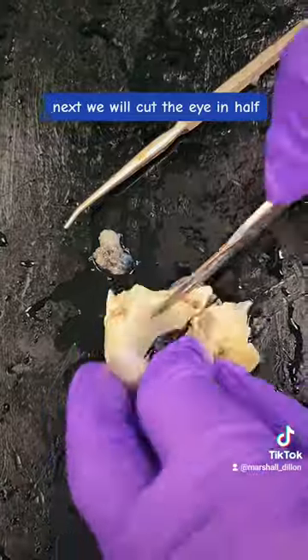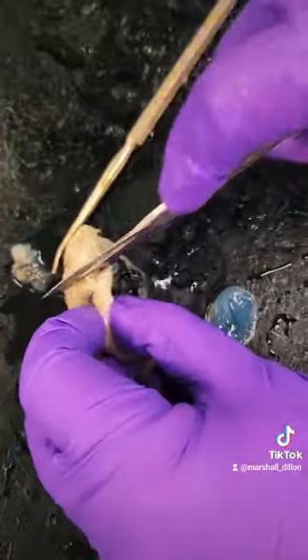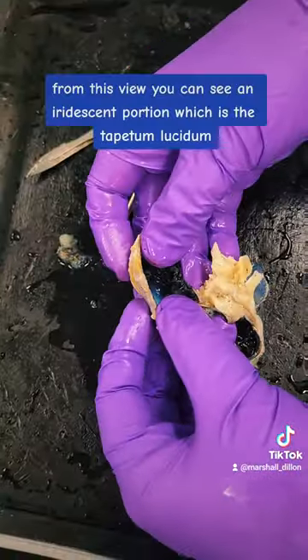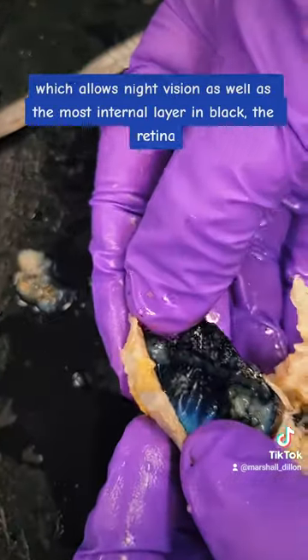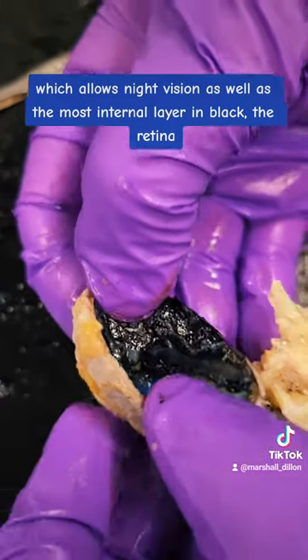Next we will cut the eye in half. From this view you can see an iridescent portion which is the tapetum lucidum, which allows night vision, as well as the most internal layer in black, the retina.